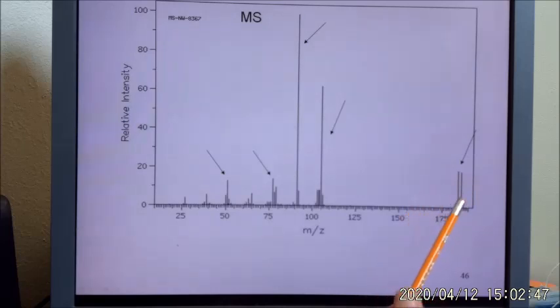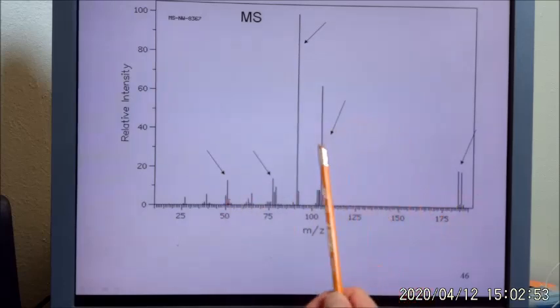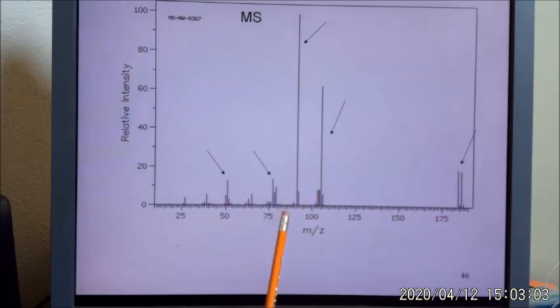Look at that. Bromine. It's beautiful. M plus and M plus 2. I lose the bromine. That's how I get the 105. So from here to here, I lose a bromine. And then from the 105, from here down to here, that's 80, 85, 90, 91. So I have a tropylium ion. So I know I have a benzene ring and a CH2. And these guys are just losing directly, getting the benzene ring as my carbocation, and 51, remember, that's going to be losing my C2H2.